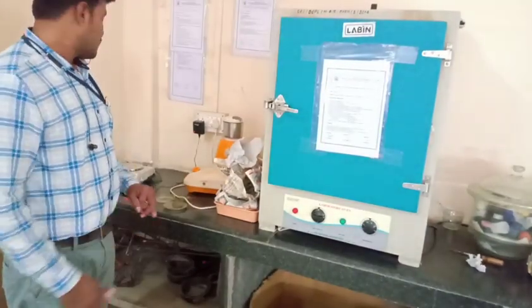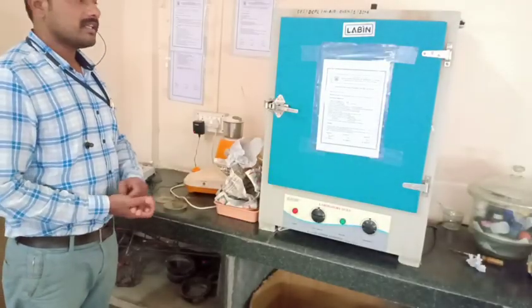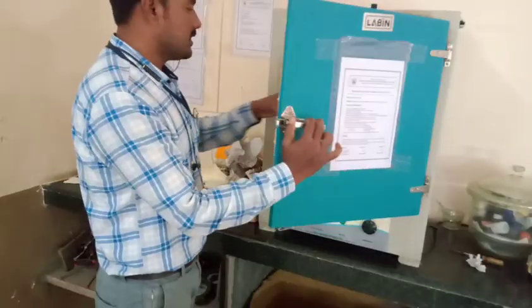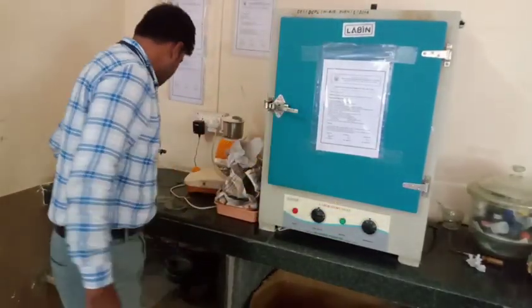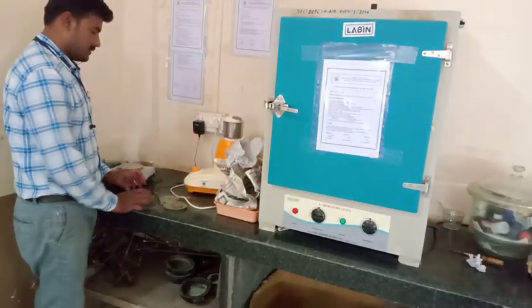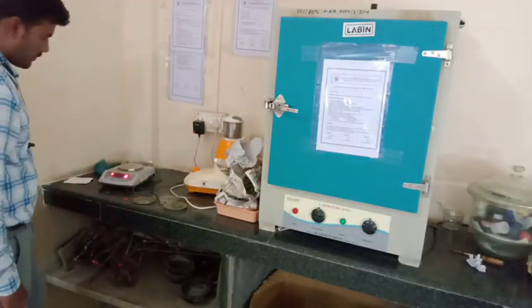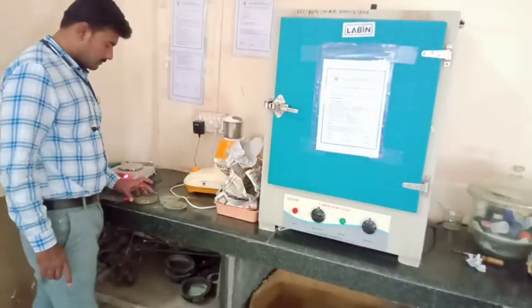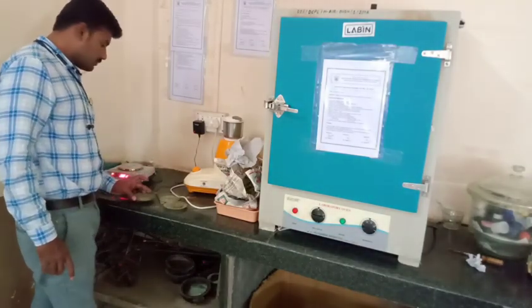Now 3 hours are completed. After 3 hours we have to take the plant material, that is our petri dish, out of the oven, and wait for it to cool. Now our petri dish is cool.